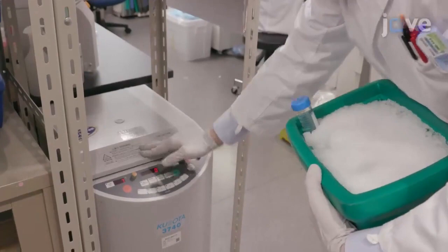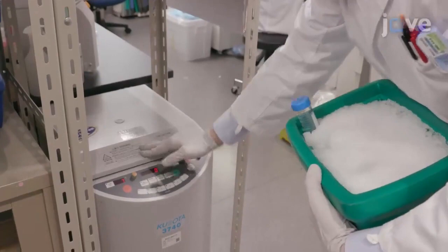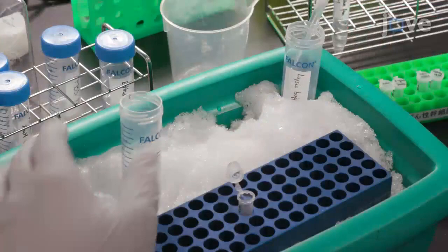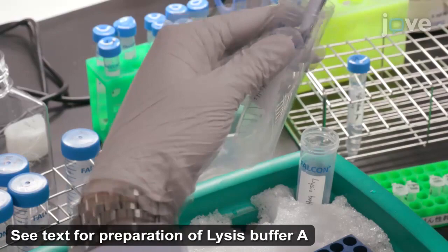Then centrifuge the sample at 1,450 times gravity for 5 minutes at 4 degrees Celsius and discard the supernatant. Use 1 milliliter of ice-cold lysis buffer A per 10 million cells to lyse the cells by gentle pipetting.